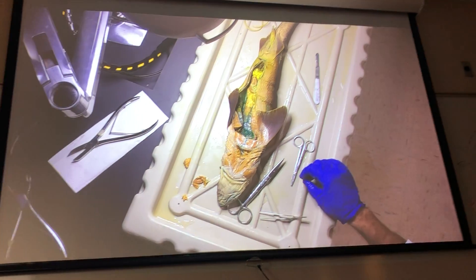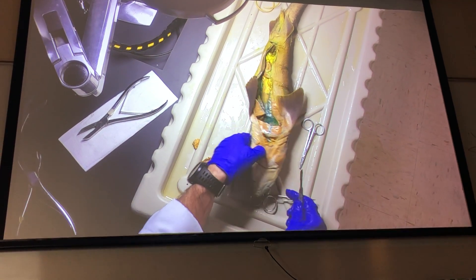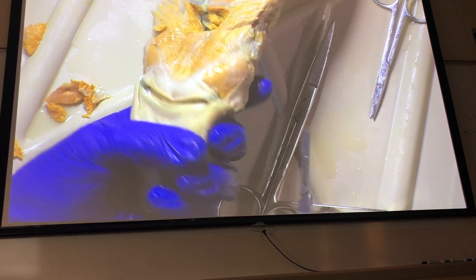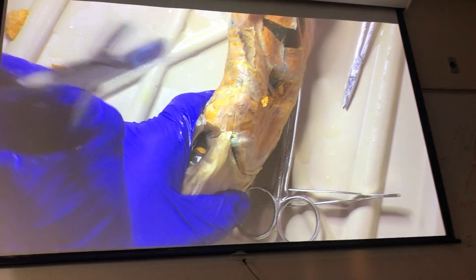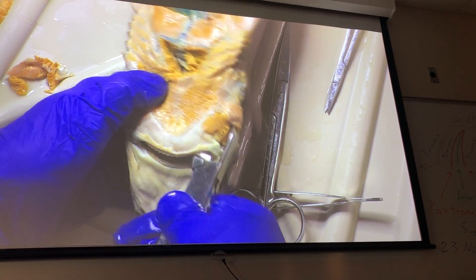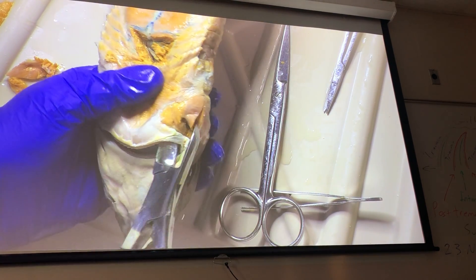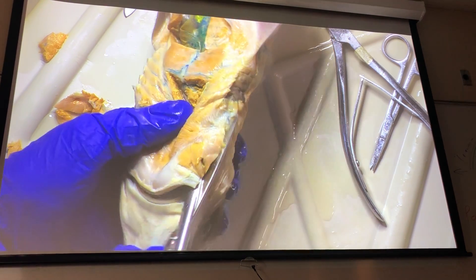The next part is the challenging part: opening up the jaws. Be careful, the teeth are sharp. We're going to cut through the muscle — that's going to make it easier for you to go into the jaws of the bone clippers. Seriously, be careful of the teeth here because they are going to be sharp. They're small but they're sharp and there are lots of them. You may want to have the large scissors with you to help augment the bone clippers as you go.